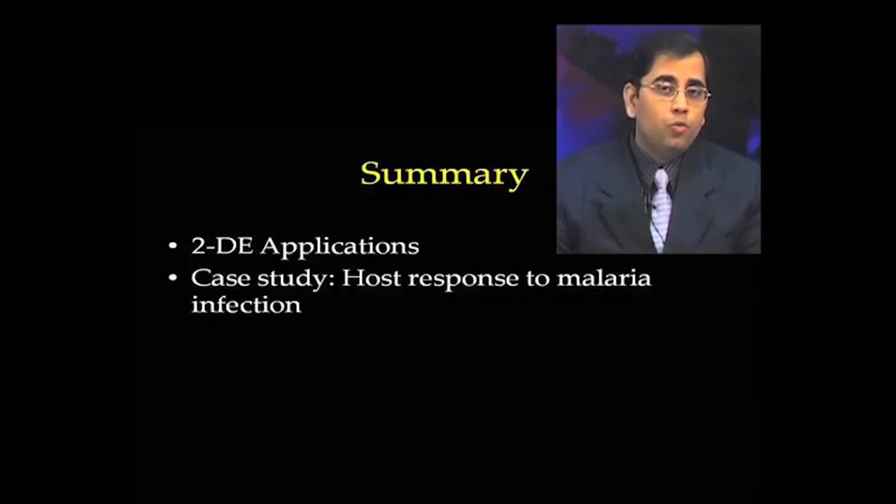So, today we discussed not only one application, how host serum proteins change due to one of the Plasmodium parasites, but also the various nitty-gritty experiments one needs to perform to achieve such a comparison. We will continue our discussion on some more applications of two-dimensional electrophoresis and also two-dimensional difference gel electrophoresis, because due to the variations in 2DE, people also try two-dimensional DIGE experiments, which is very sensitive. So, that also expands the overall proteome coverage. We will continue our discussion in the next class. Thank you.